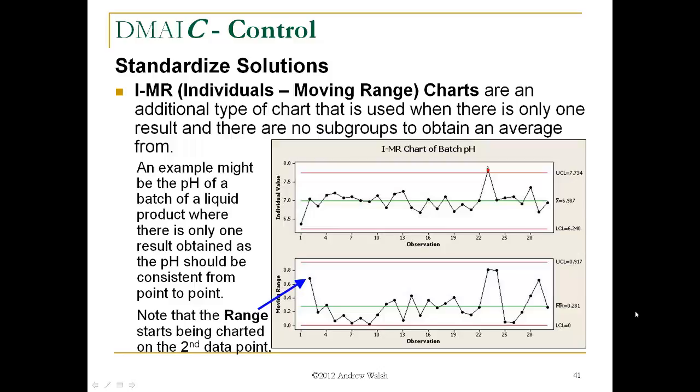Note that the range starts being charted on the second data point, because it's the difference between the points, the moving range. So as each point is added, the calculation from the first point to the second point becomes the range. Second to the third is now the range.